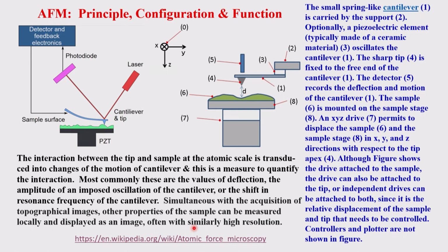it. So as I told you, you have a tip or a probe, you can call it, and this probe is the one which will move on your sample, or the sample can be moved, and then there will be deflections. To understand these deflections, you need to have some light incident on that, and based on the movements, the reflection of the laser will change, the angle will change, the strength will change.